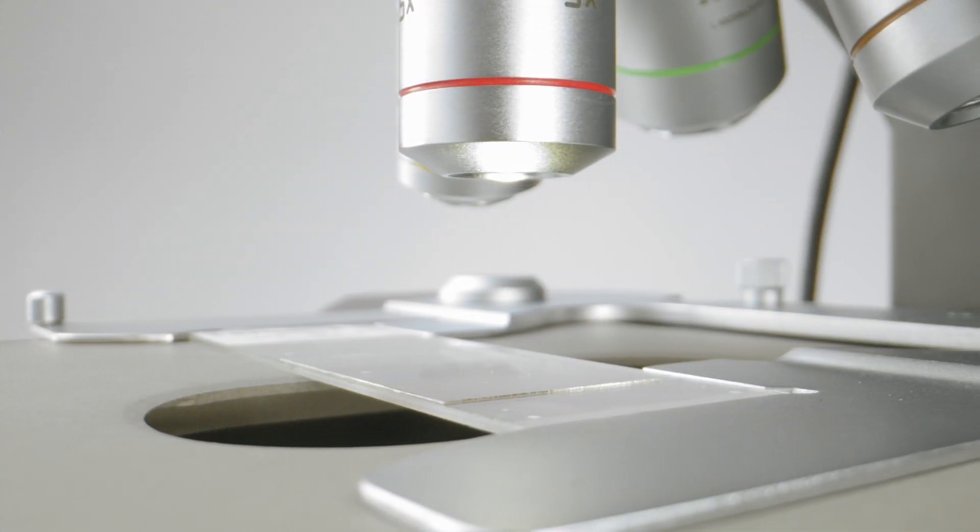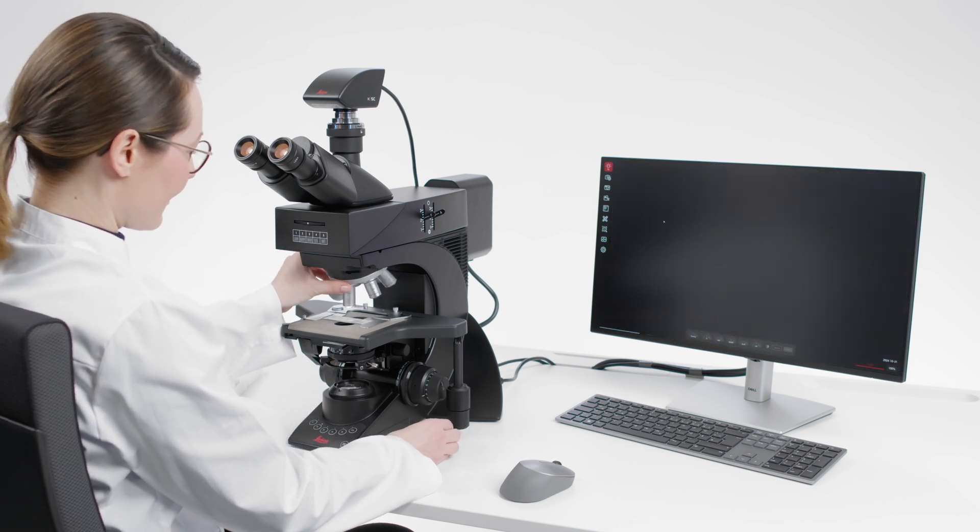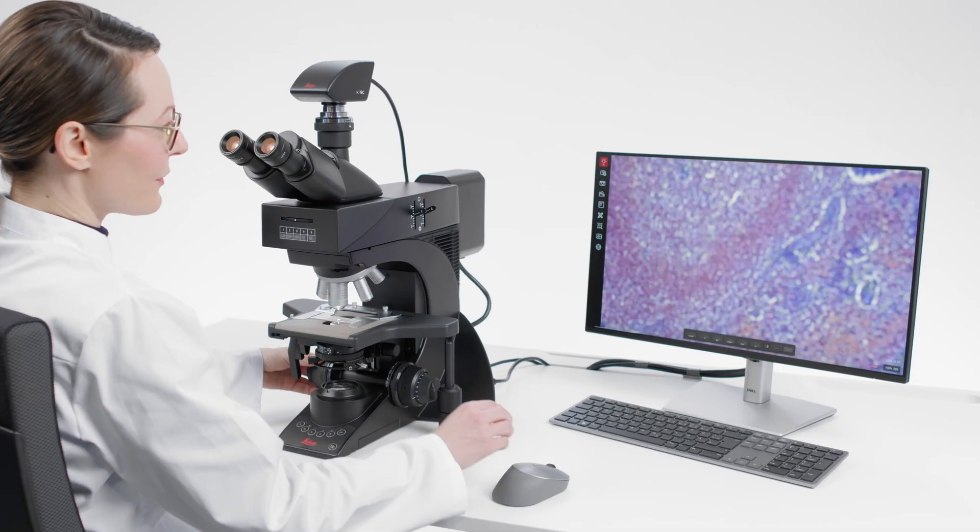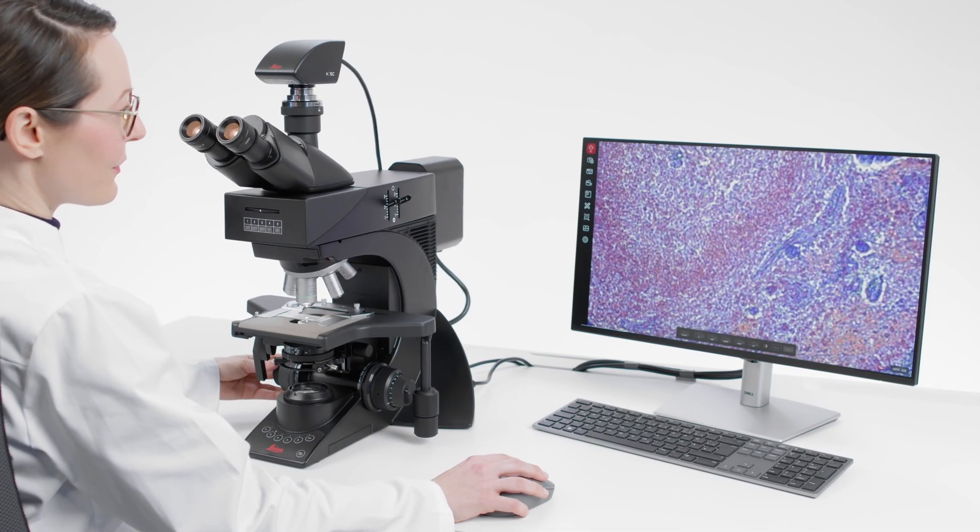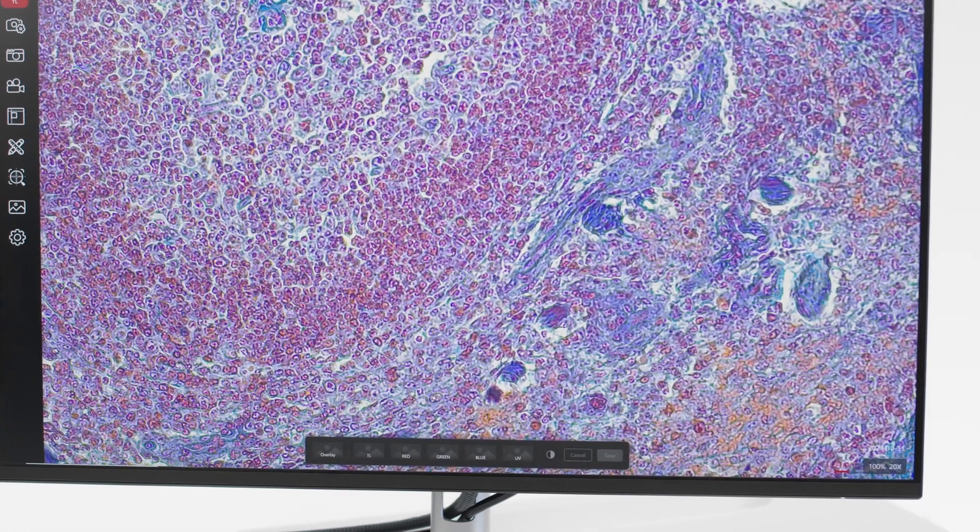Move to a potential region of interest and easily switch to a higher magnification. Examine the specimen to see the fine details. The current magnification is also displayed on the screen.